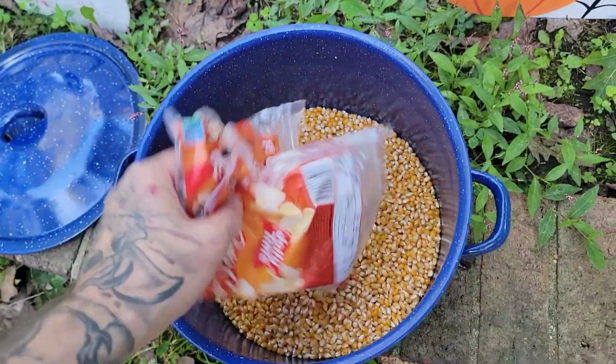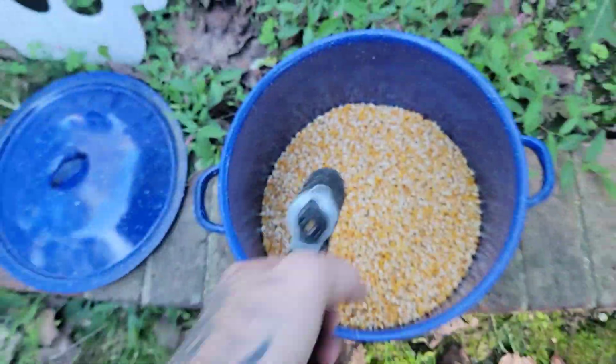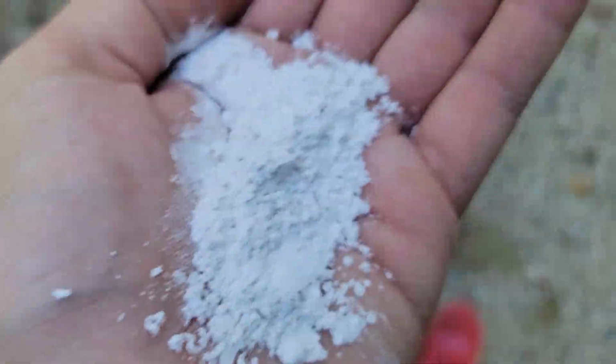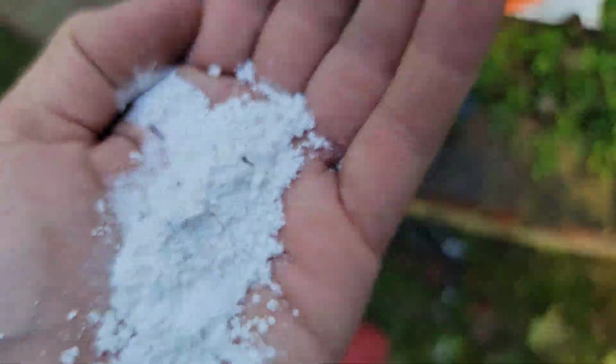We'll hydrate grains with it. Cold water. We got that good, good powder. We got that good, good gypsum.